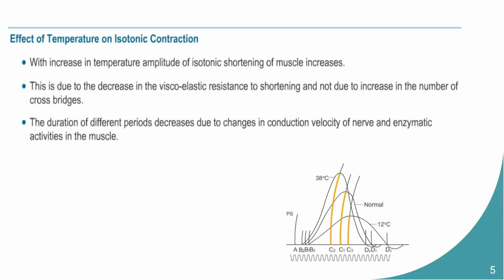Okay, so what about the duration of latent phase, contraction phase and relaxation phase if we increase temperature or decrease temperature? And what is the effect of it on the height or force of contraction? It is obvious that when we are increasing the temperature, the height of contraction, you can see it is much more increased than the initial SMT. And if we measure the duration of the phases, we can see that the duration of all phases will be shortened in case of high temperature.